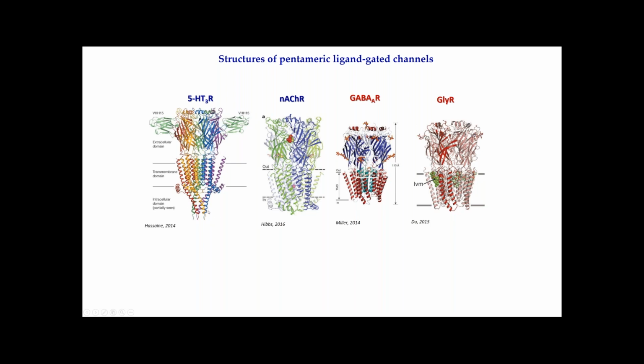This domain is important for trafficking and also post-translational modification and regulation of channel functions. This region has been problematic from the structural biology point of view, given its unstructured nature and high flexibility, and so it has been previously truncated or partly truncated to allow for high resolution structure determination.